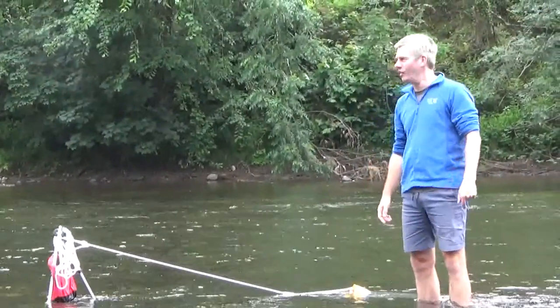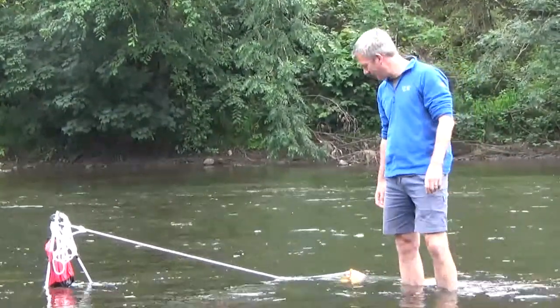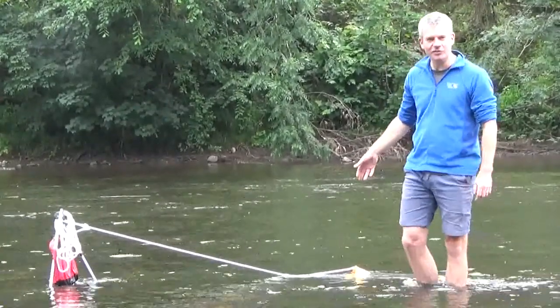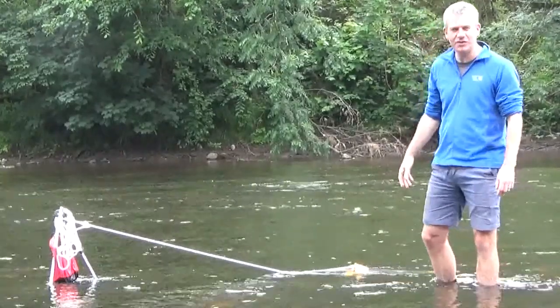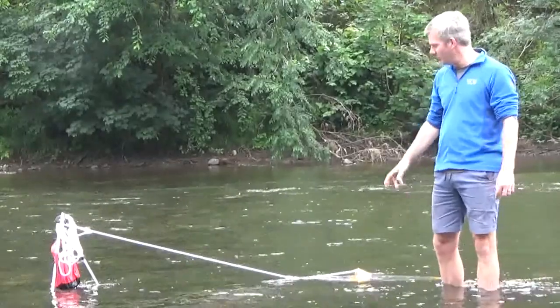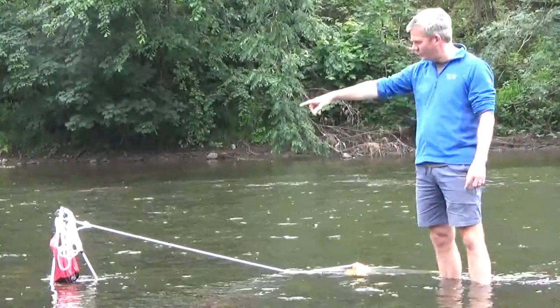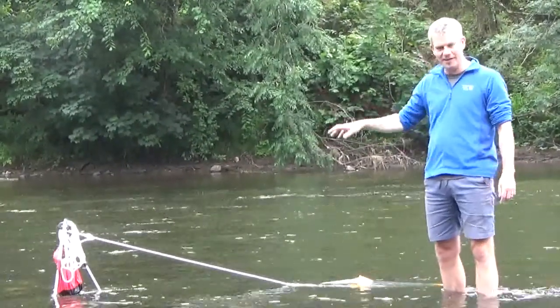We're here on the River Rusk on a slightly wet Saturday morning, just trialling out the plankton net that we're going to use to collect water samples and sediment samples when we're on the Peel and Mackenzie Rivers. We've got the plankton net here attached to a tripod. The red bag you can see there has just got a couple of rocks in it to weight it down.